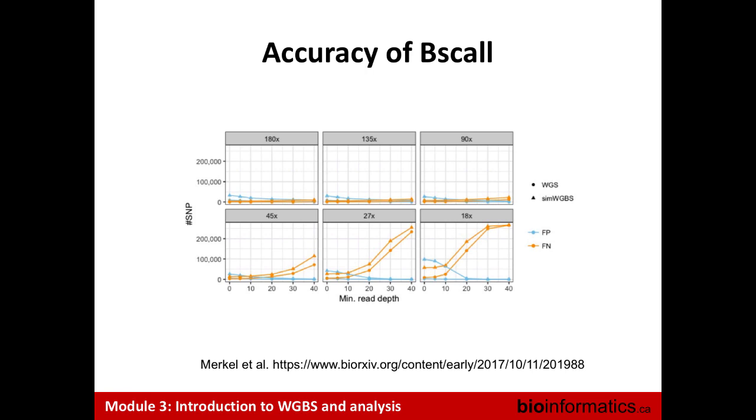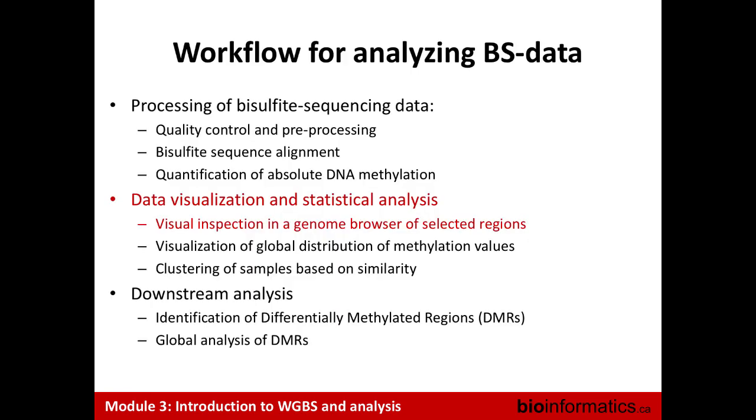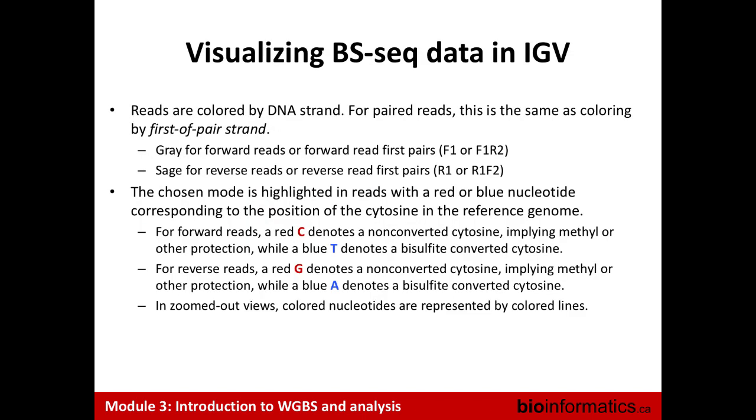Okay, so moving on to something that we will do in the lab, as well as data visualization and some aspect of statistical analysis. One of the things that's quite helpful with your data once you've aligned it is to look at it in the browser. For the particular lab that we're going to work on, we're going to use IGV, which hopefully you've installed on your computer as per the instructions.